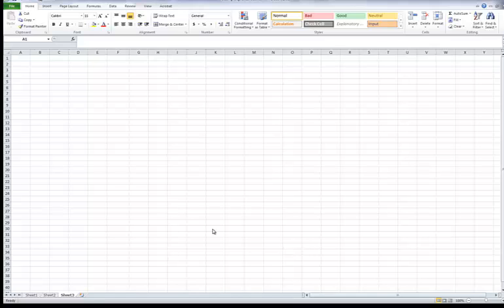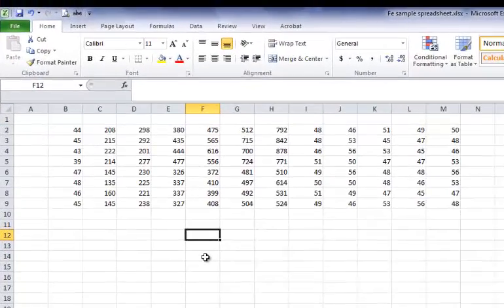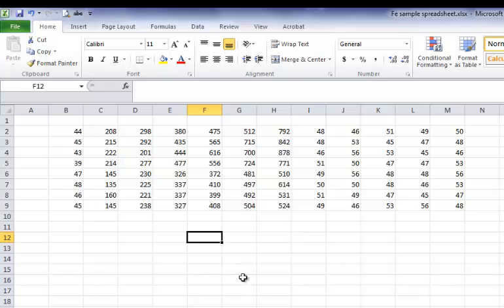I've got a blank sheet here on my spreadsheet, and you can see the different sheets down at the bottom here, and each one can be a completely different set of data or a different analysis that you want to do. On sheet 2 here, I have a set of data from an iron experiment. And so this is typical of the output that you would get from the iron experiment. And I do want to point out that what I'm about to go through is really specific to the iron experiment, but the details we'll get into with calibration curves can apply to a lot of different experiments.